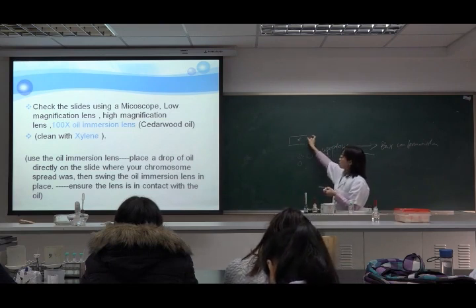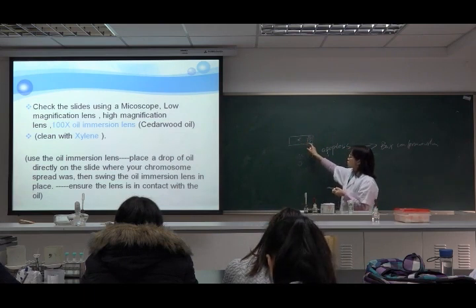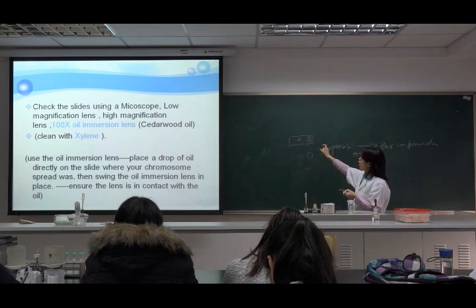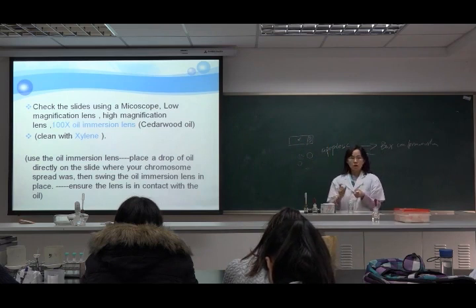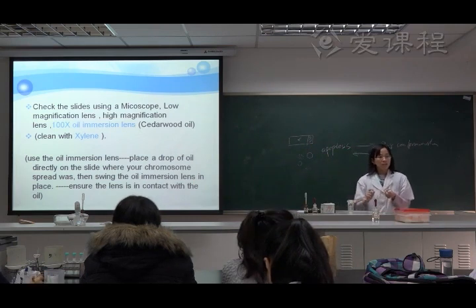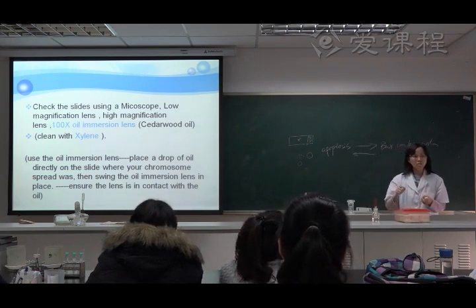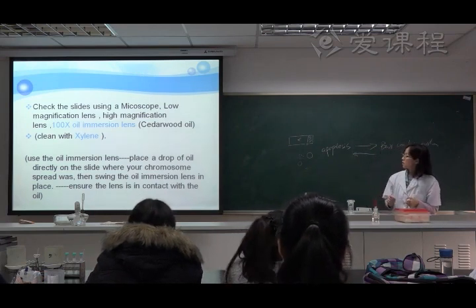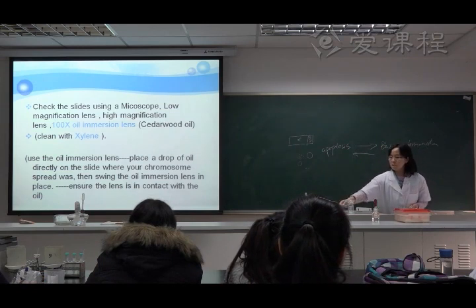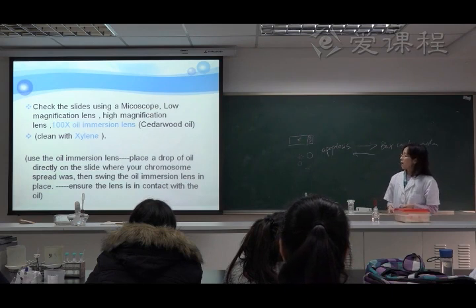Then you swing the lens in. Just make sure the lens is in contact with the oil. Can everyone understand? Okay. Yes, touch the oil. This is something I want to mention here. And then you can observe the result.